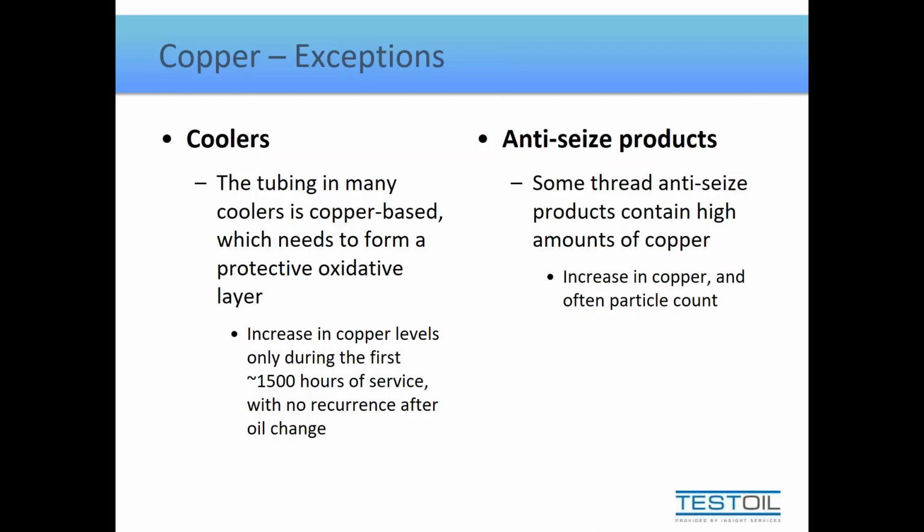This generally takes upwards of 2 months to form, and in that time, that oxide layer may leach into the oil. So copper will appear in the oil, but it's not necessarily a sign of wear. It's not really corrosion. It's not actually a problem. And after you've changed the oil, it likely won't return.